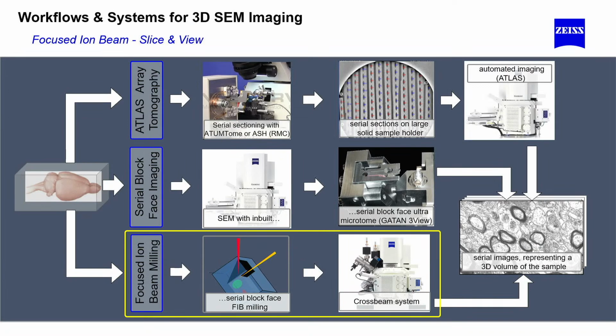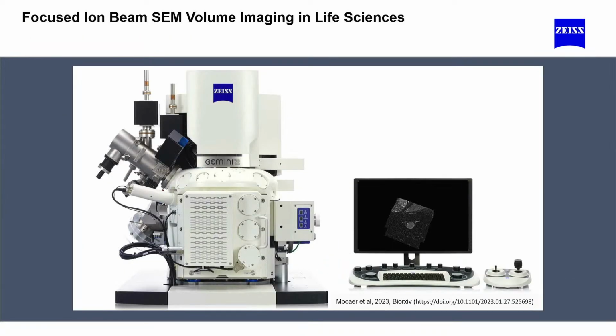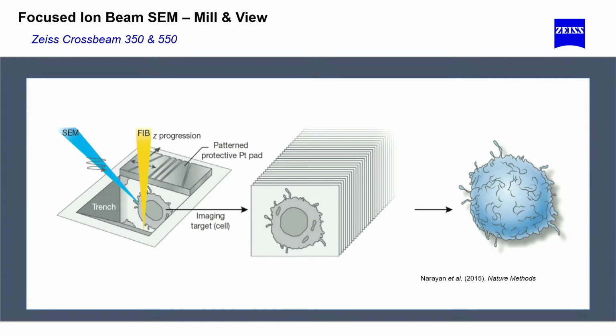Okay, so as I said, just a short update on this, and I would like to spend a little bit more on crossbeam imaging, starting with well-known basics, but let's have a look at the sample size, what we can approach with this kind of technology.